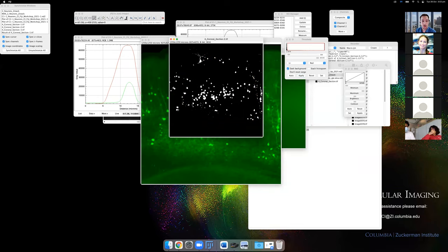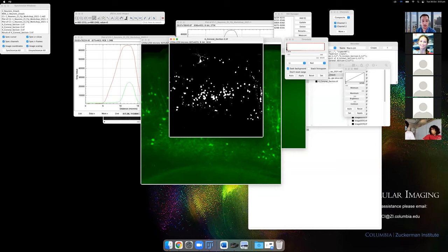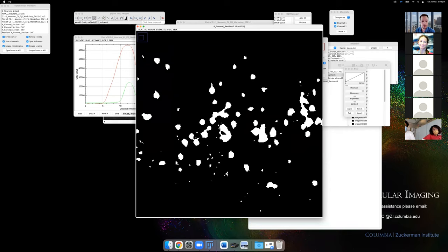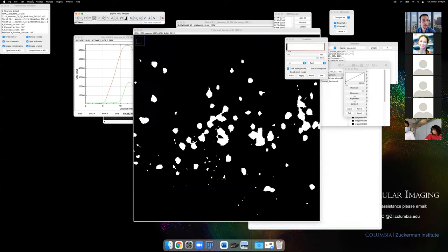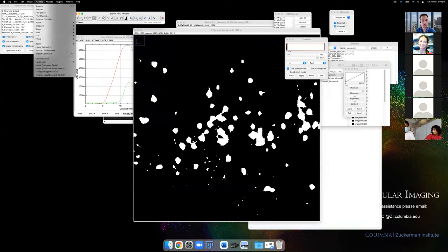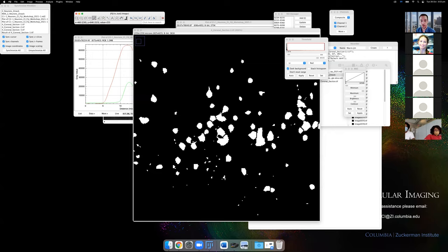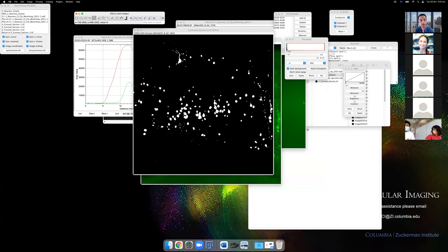After applying the threshold you have some cells segmented, some small background fragments, and some cells that are joined together. An easy way to deal with over-segmentation where cells are joined is to apply Watershed — this finds a break point between adjacent cells. Under Process > Binary > Watershed, you should see breaks appear between previously joined cells. This is a quick and dirty way of separating touching cells.